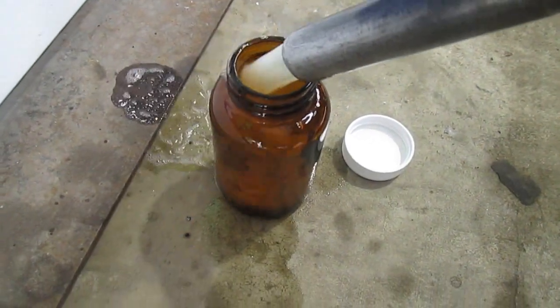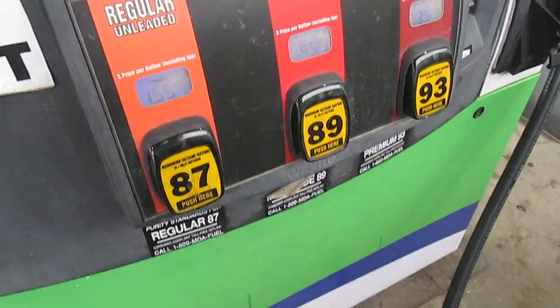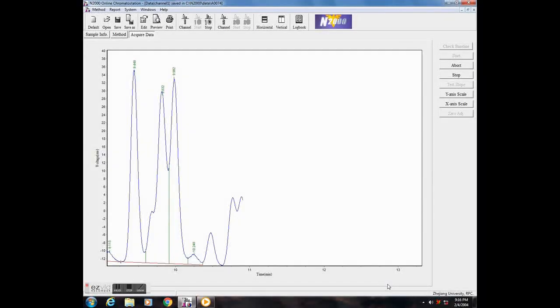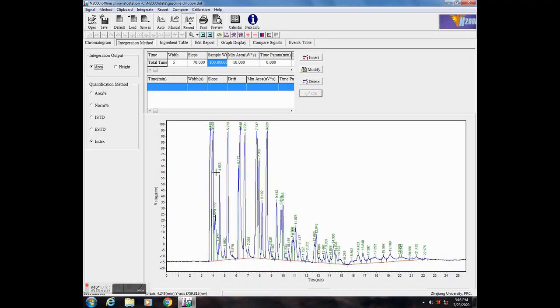I wanted to try something a little more complex — this is 87 grade gasoline from the gas station. Gasoline is a very complex mix of hydrocarbons, and I was successfully able to identify a few of them and compare them with professional results. Since the composition of gas does not vary much, I could use it for further identification.